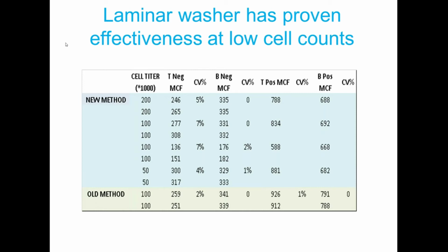So what do you do? You rely on all the HLA experience you have to isolate as many B and T lymphocytes from your donor's tiny lymph node or small piece of spleen or 5 mL of blood. So you pull it off, but you still need to cross your fingers and hope that your cells will remain intact and stable throughout your washing cycles.